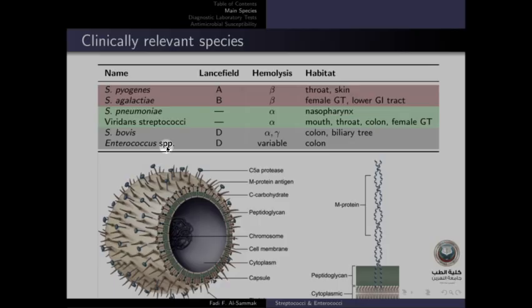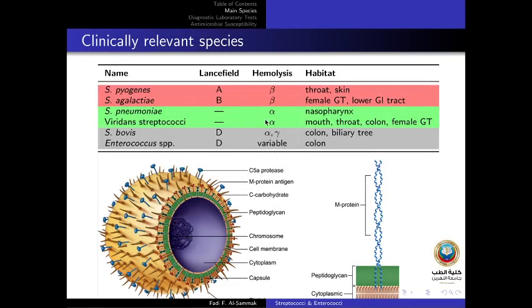And it's the same health problem that we already encountered in the previous lab session when we talked about Staphylococcus aureus, as you remember, being a cause for nosocomial infections, and because of their resistance. Also, the same story here is seen with Enterococcus species. All right, so now we have the three major groups here.